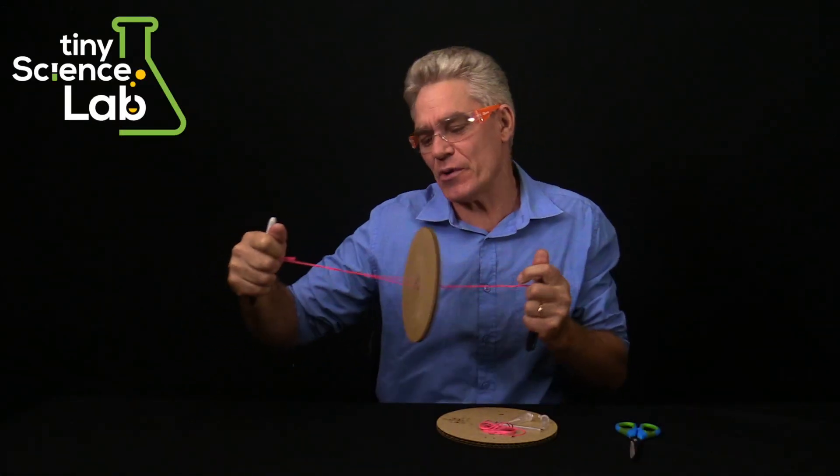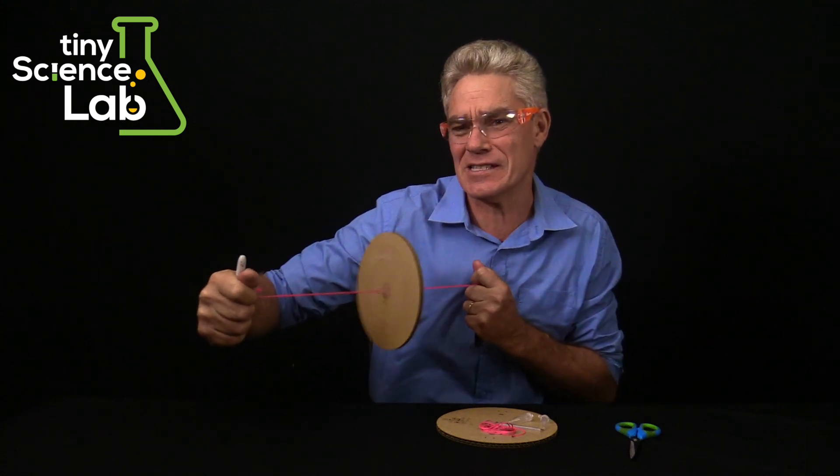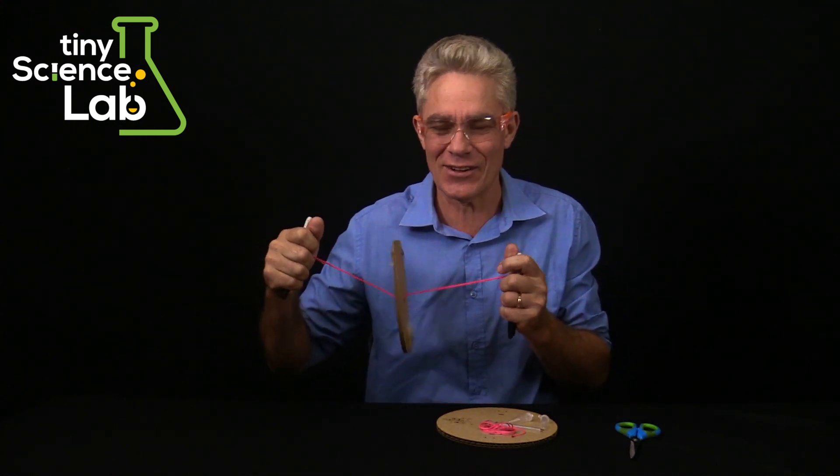Hey everyone, this video is on how to build and use the cardboard centrifuge supplied by Tiny Science Lab.